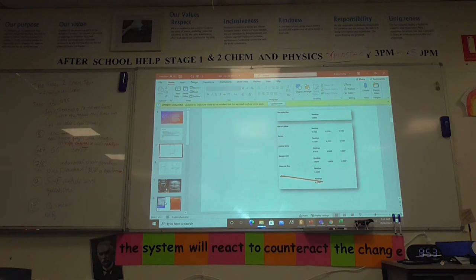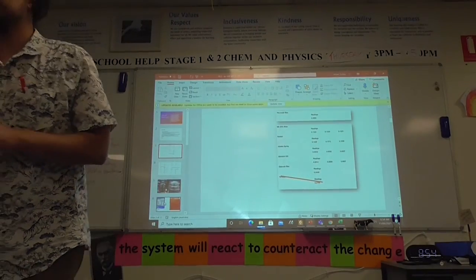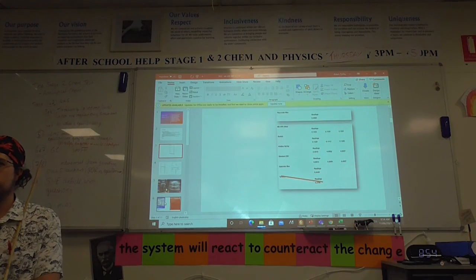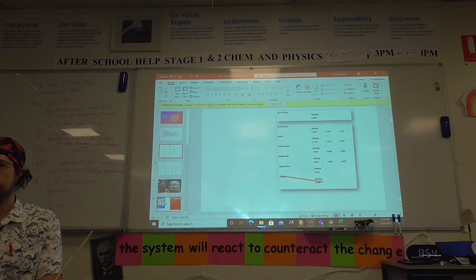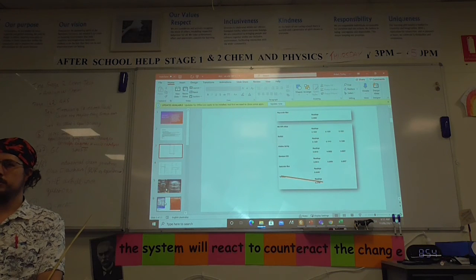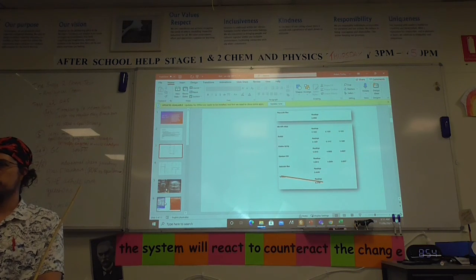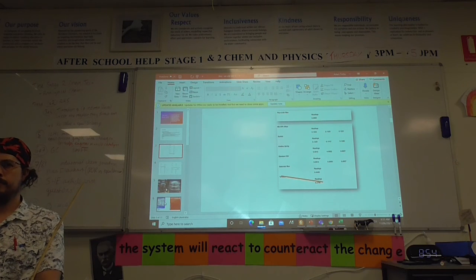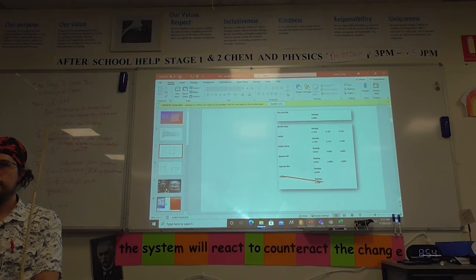The best thing you can do from here is to actually do the exam questions related to it. You may be hit up with knowledge questions like, how come zinc contaminating the sample is not going to affect your ability to detect sodium? You have to answer why based on an absorption spectrum. And there are a few questions where they've compared the spectrums, and they've said, which wavelength would you choose? There'll be a bunch of wavelengths which are all close to each other, and then there'll be one of the element you want to find which is just sitting on its own. You circle that one, and then you explain why. Well, because it's not going to get interfered with by the other ones.